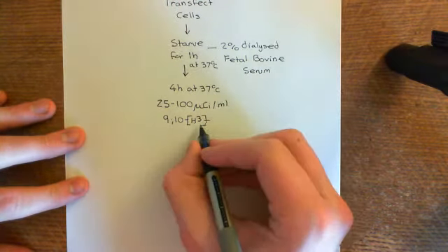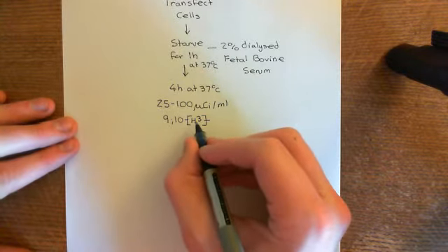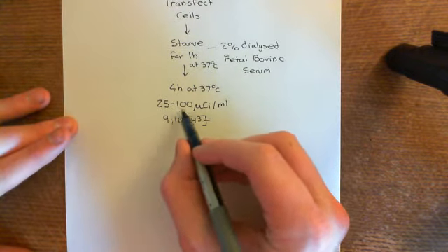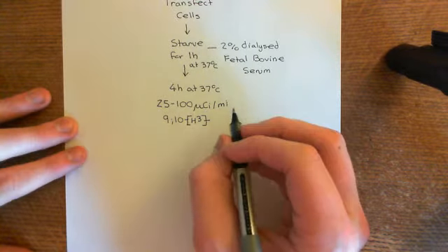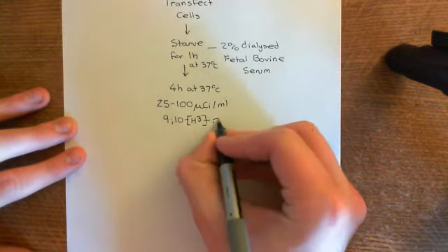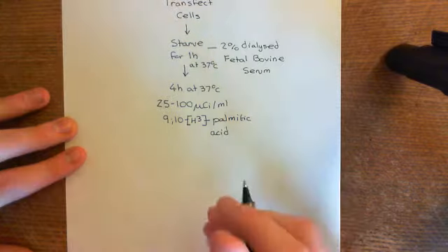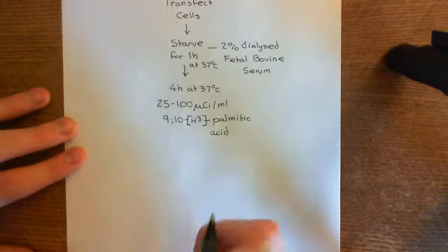Now, the palmitic acid has a certain likelihood that it will disintegrate at any second, basically. So you will need a concentration of palmitic acid that results in a certain number of disintegrations per second, and curies is basically just another unit for disintegrations per second, but let me show you that in a moment. So you're going to add a certain concentration of 9,10-tritiated palmitic acid, and this concentration will need to result in a certain level of radiation.